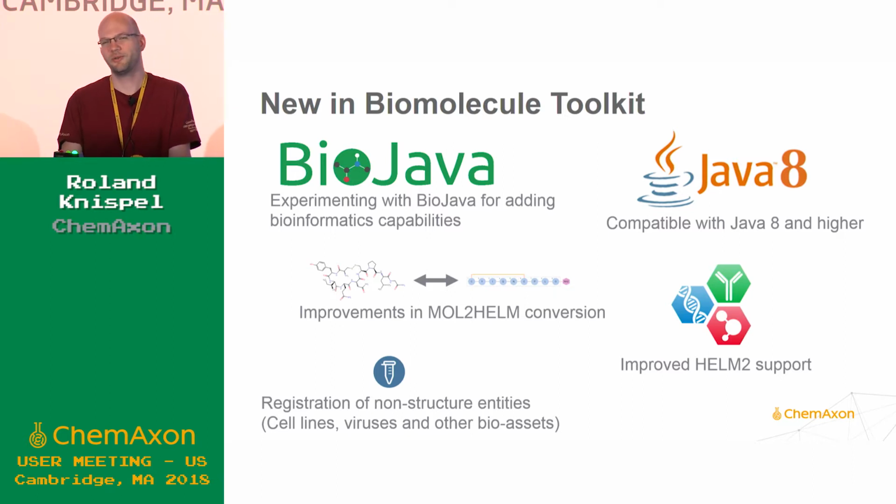So it's not really a complicated thing to advance to, but it's something that opens the whole stack of being able to capture everything that you use in your workflows in order to create any type of biological modality.